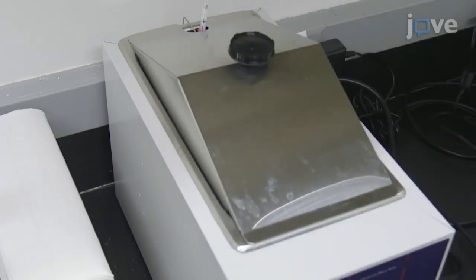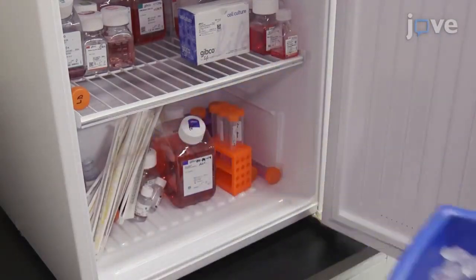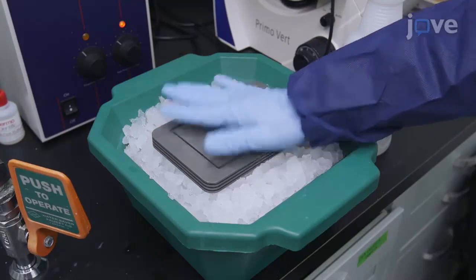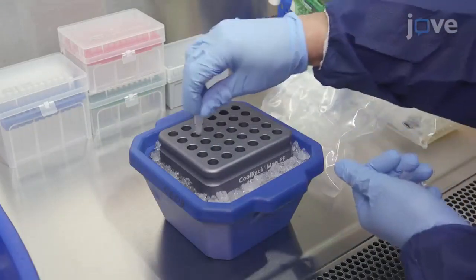a 37°C water bath. Take the thawed basement membrane matrix out of the refrigerator and put the vial on ice. Cool down the tissue culture plates on a metal platform cooler placed on ice. Place centrifuge tubes on a metal cooling rack on ice.